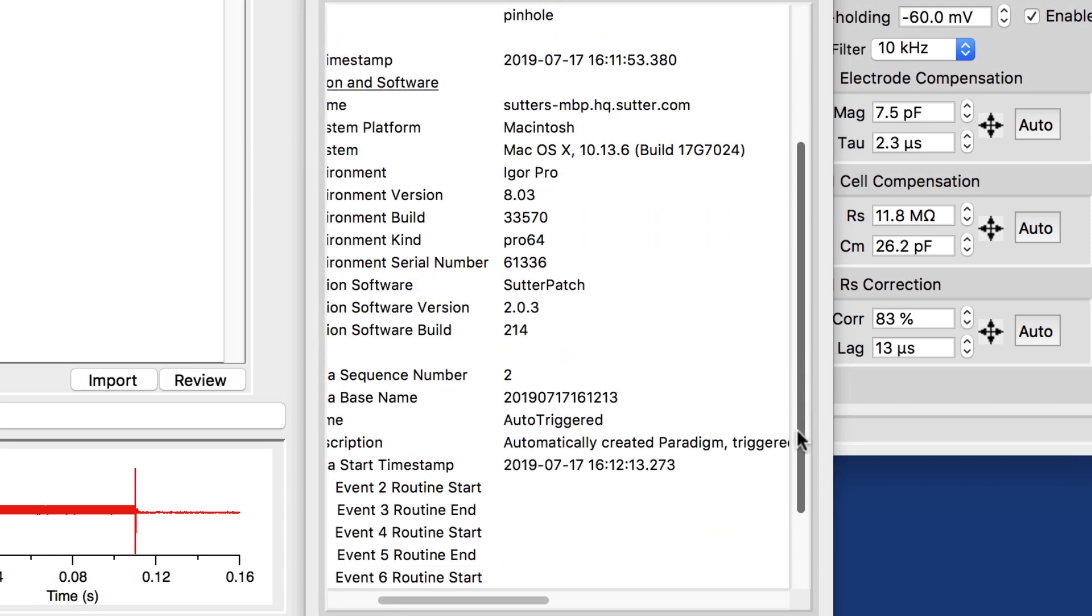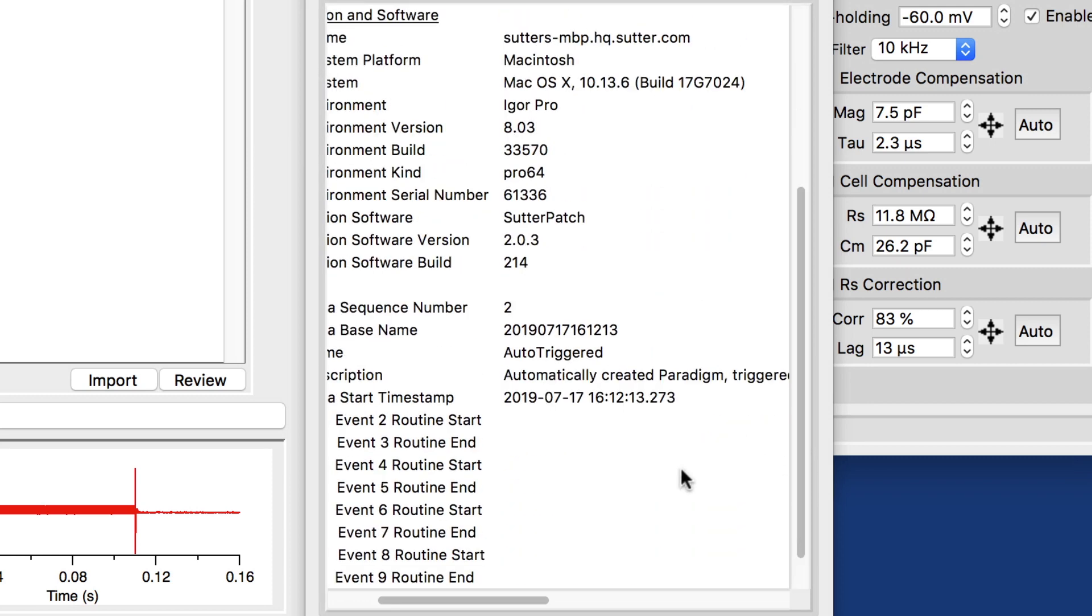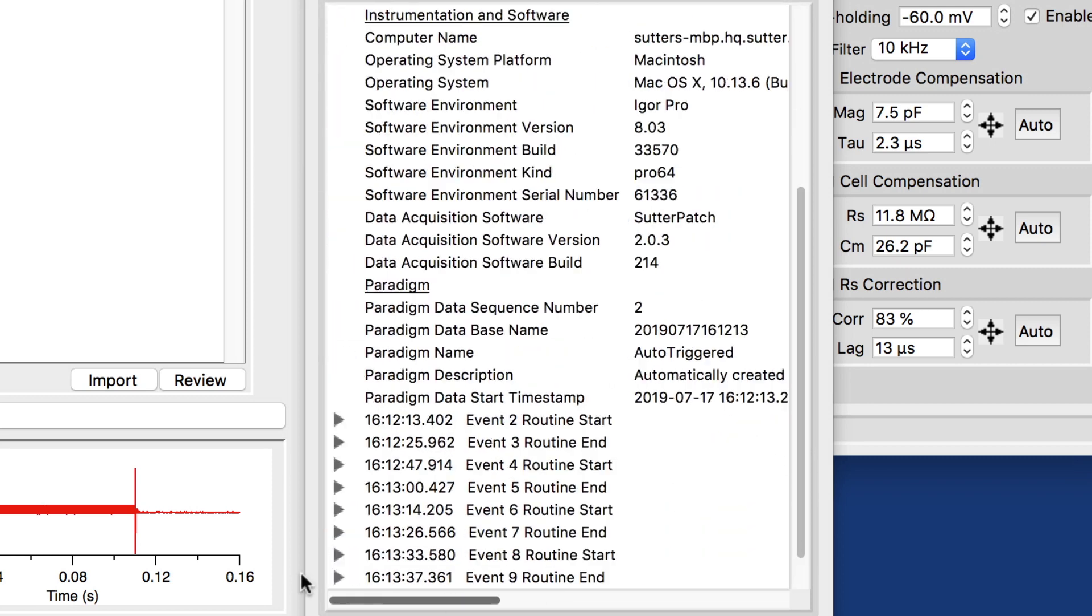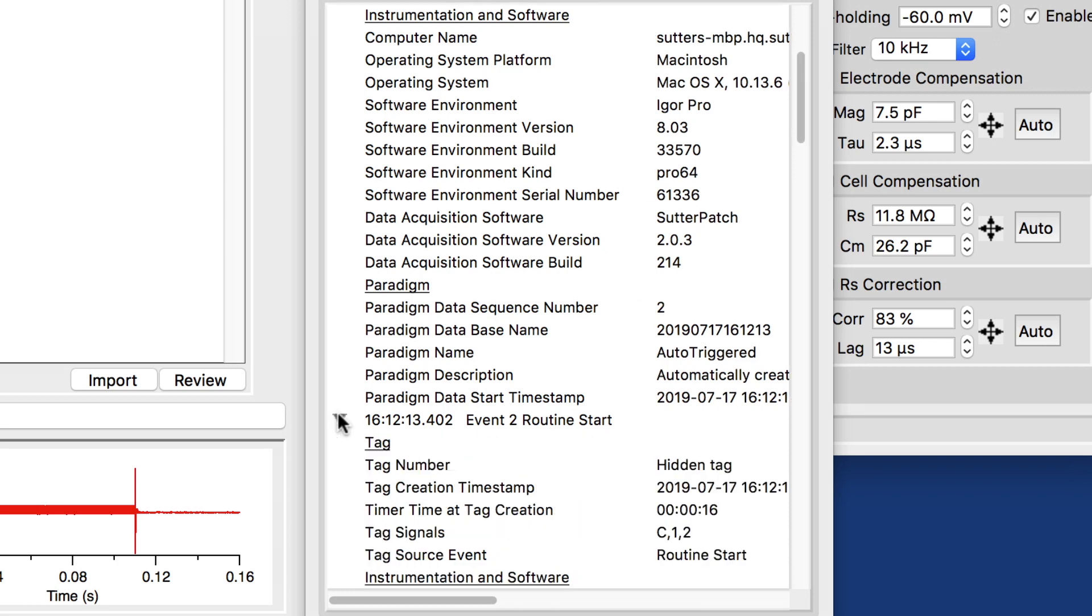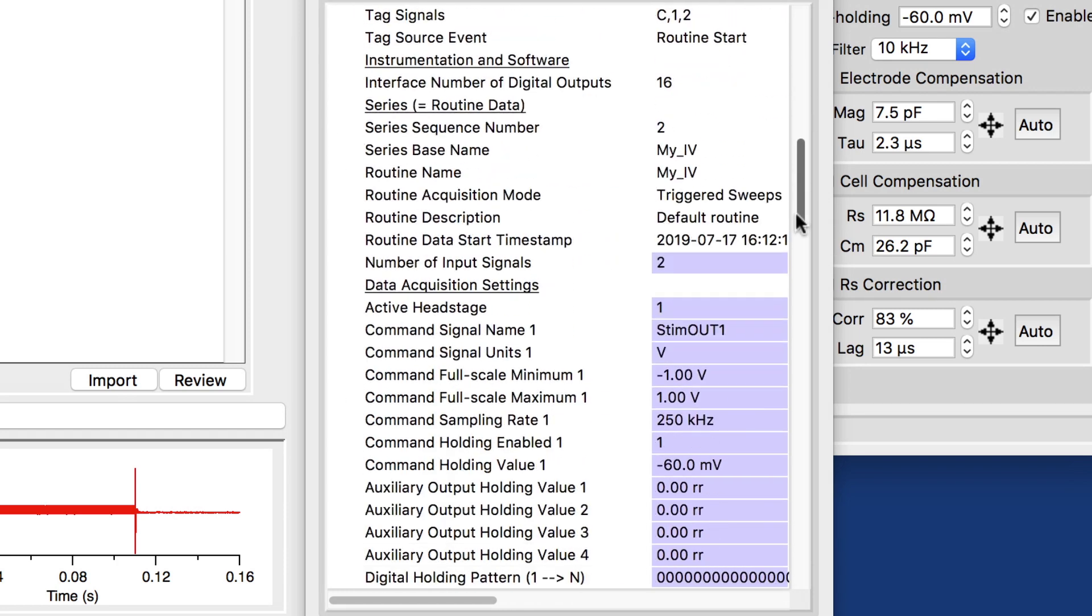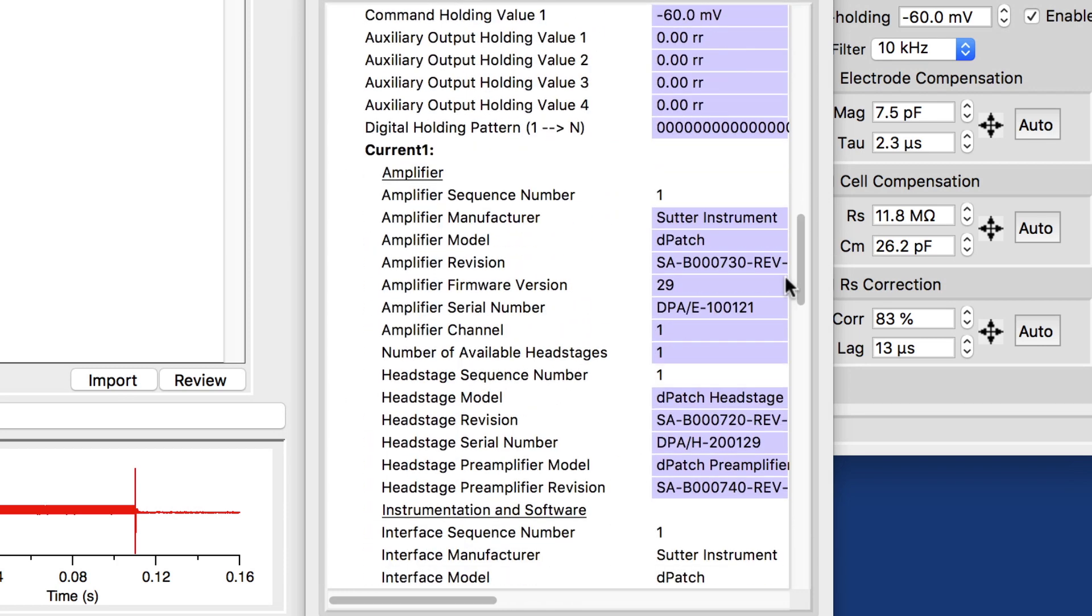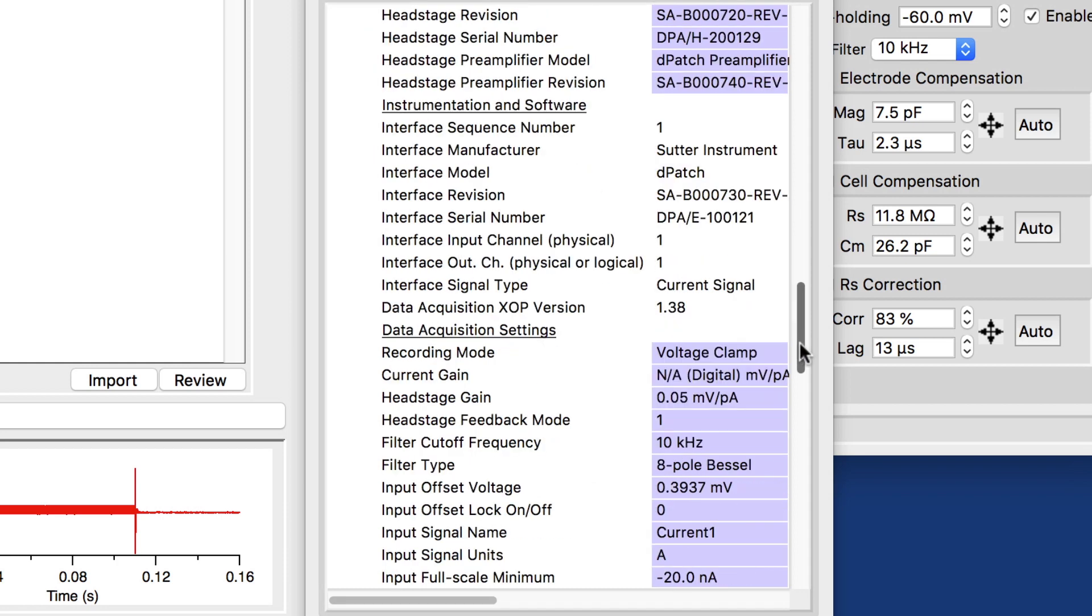And then at one point, we started a routine, the first routine that we started. Move over here. It has a description of the individual signals that were recorded, the serial number of the amplifier we used, the revision of the amplifier, the firmware version, things like that.